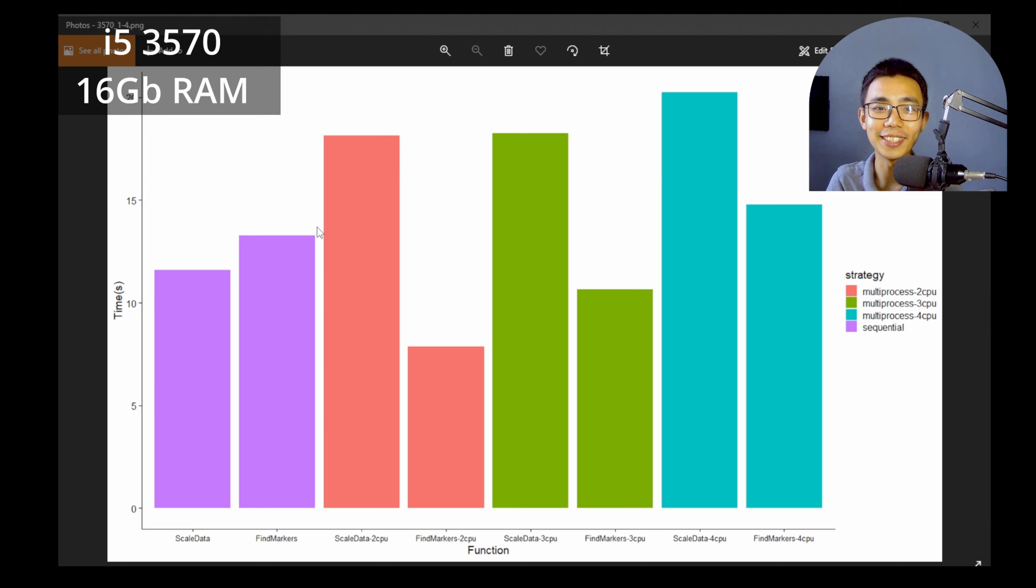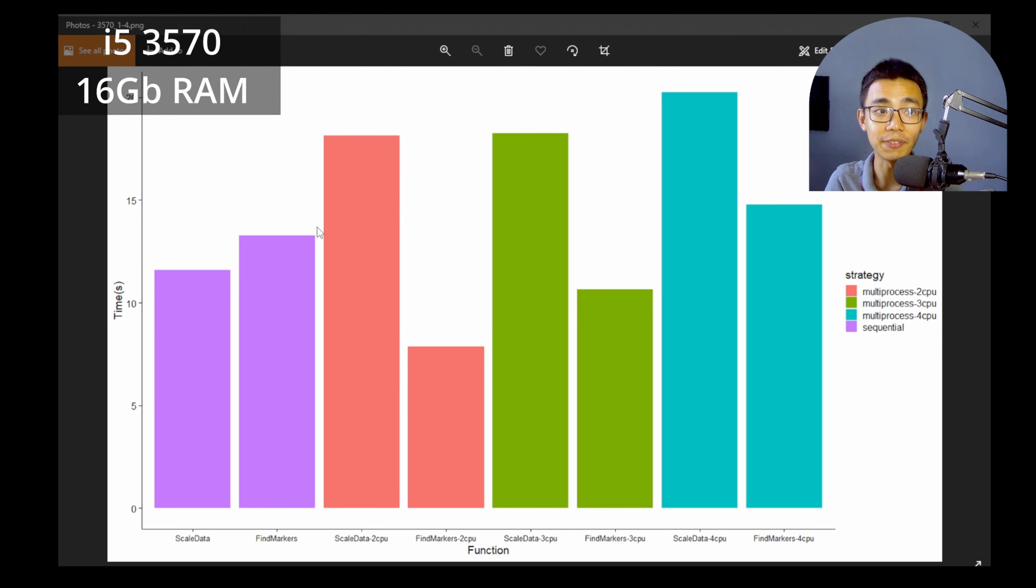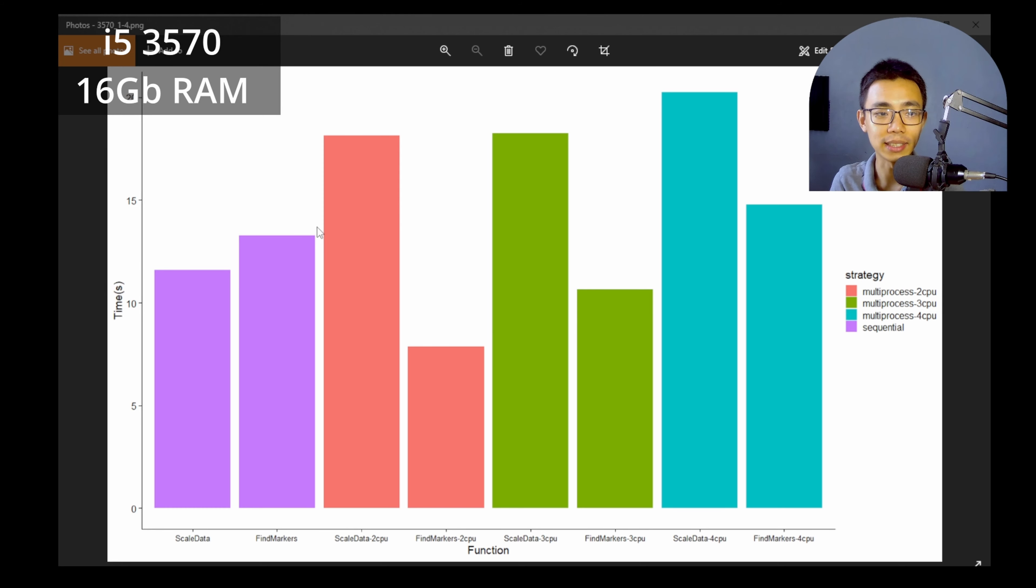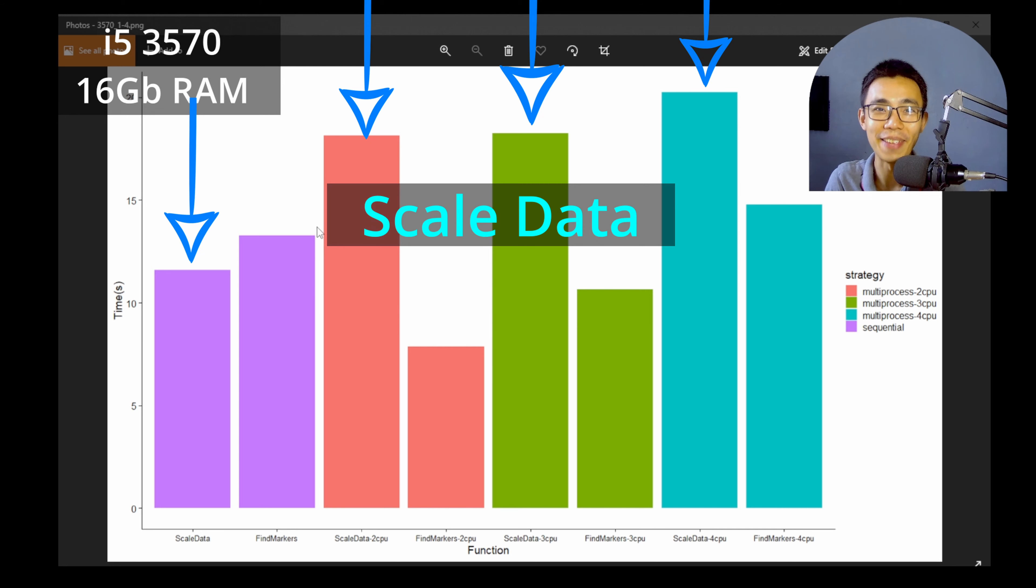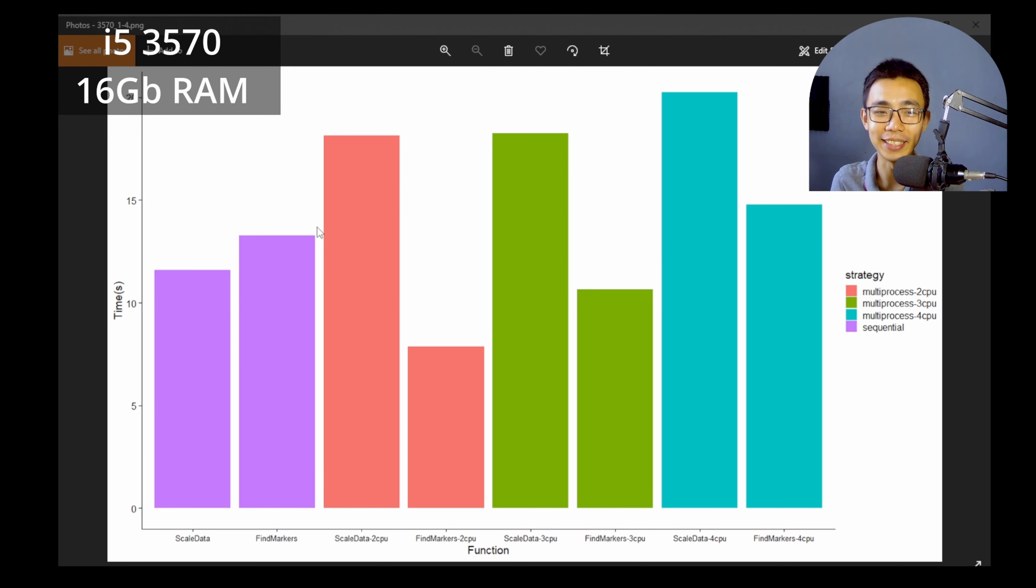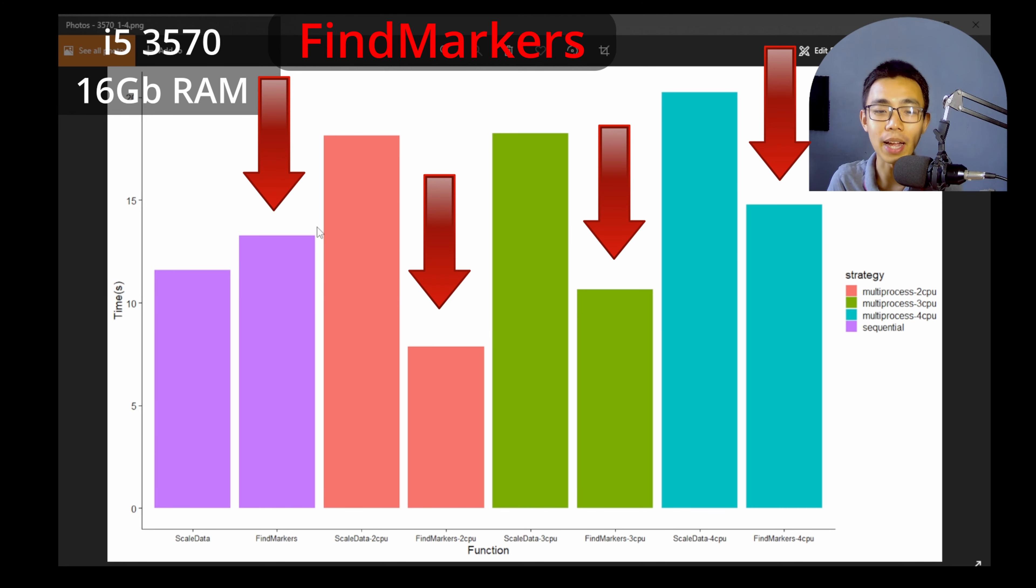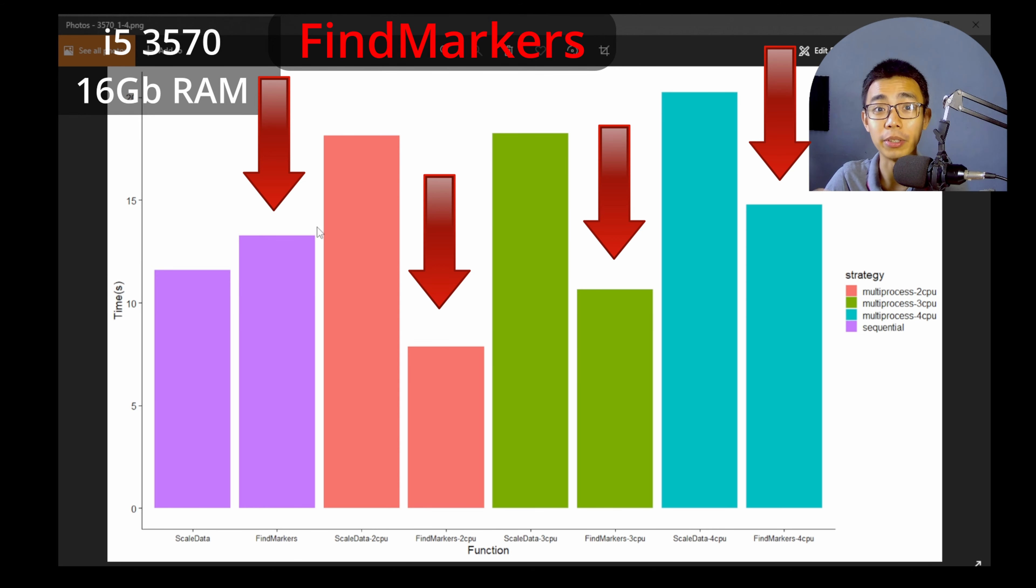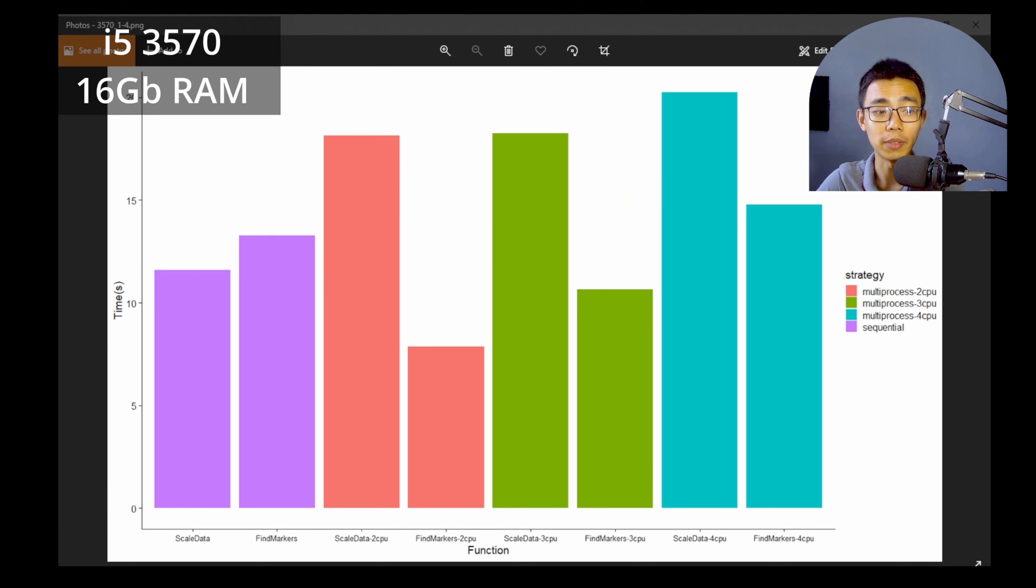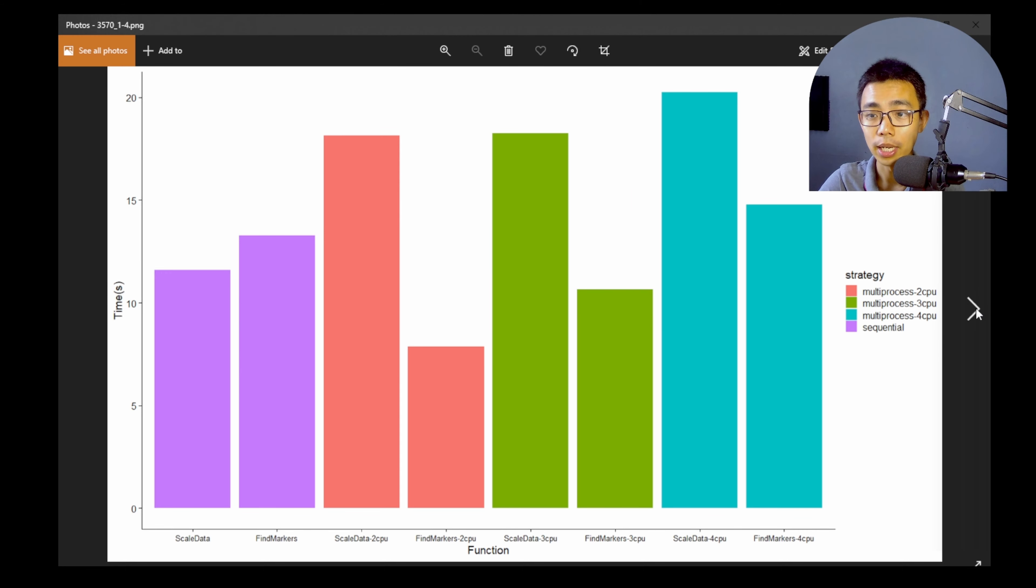Okay, so this is actually the result coming from my desktop, which is a 3570 i5 from like 10 years ago. So as you can see that the scale function actually increases in time when the thread actually increases, but the find markers has a huge decrease in time when you go from one CPU to two CPU, but it increases back when you increase the more number of CPU cores.